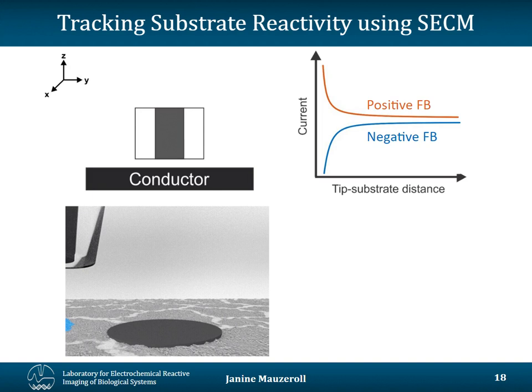And that's what we call positive and negative feedback. This is the most contrast that you can think to have in SECM.